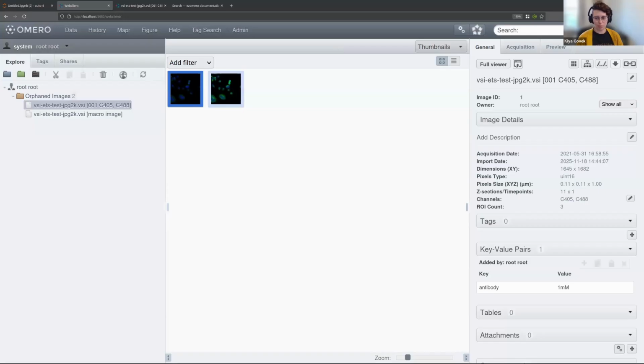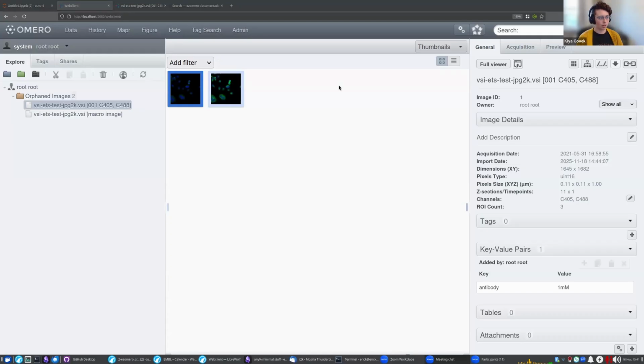Yeah, in just a second, I'm putting it in chat. ImageSC is a great forum where a lot of different OMERO admins at different institutes hang out and are very quick about responding. So if you post there and ask, hey, OMERO admins, what kind of security measures do you take for your instances? You'll get a bunch of responses from different people at different institutions.